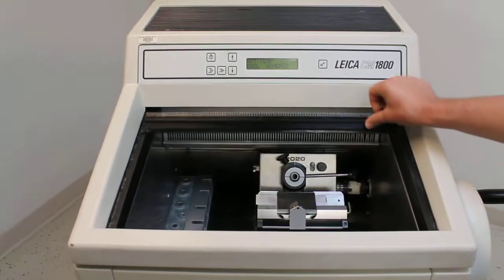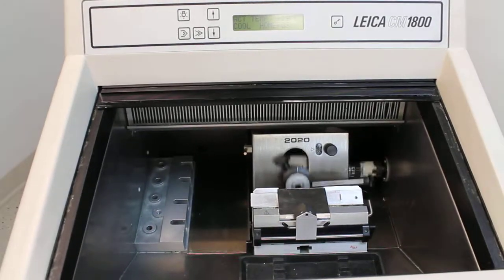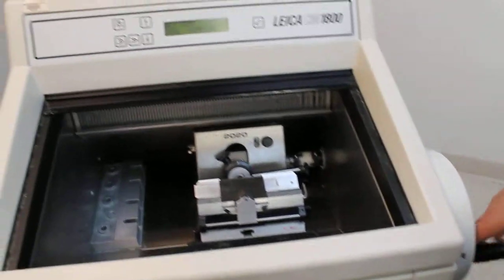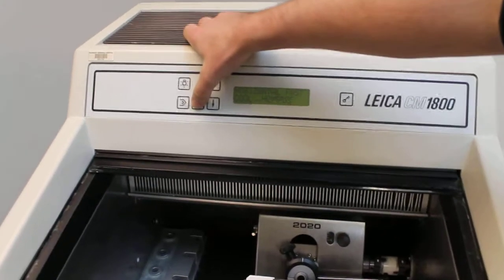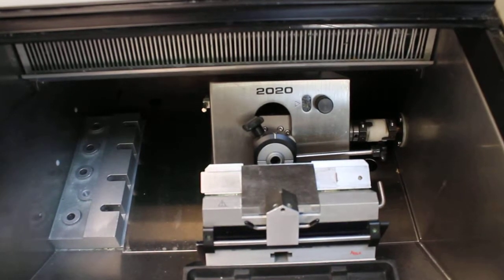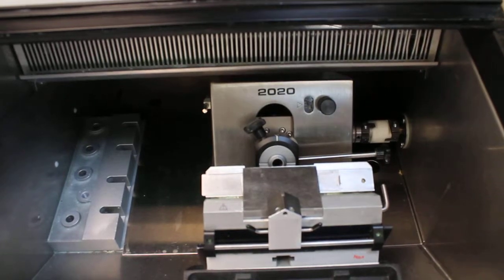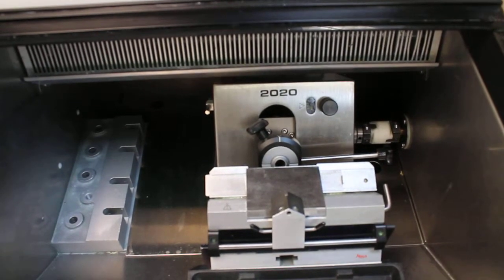The microtome itself works, as you can see. In addition, there's a motorized extension and retraction mechanism for the cutting head. It's very difficult to see because it moves so slowly, but you can hear the motor, so that mechanism definitely works, along with the light.